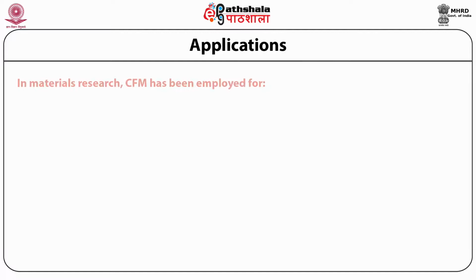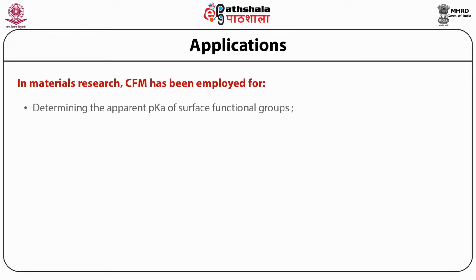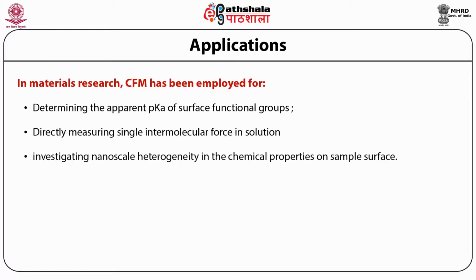So far, in materials research, CFM has been employed for, number one, determining the apparent pKa of surface functional groups; number two, directly measuring single intermolecular forces in solution; and number three, investigating nanoscale heterogeneity in the chemical properties of sample surfaces.